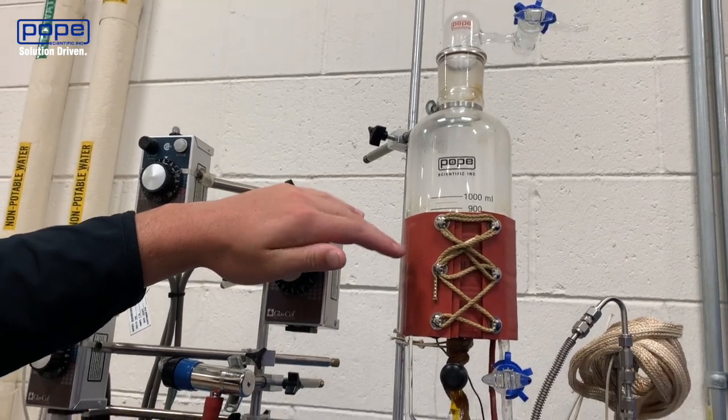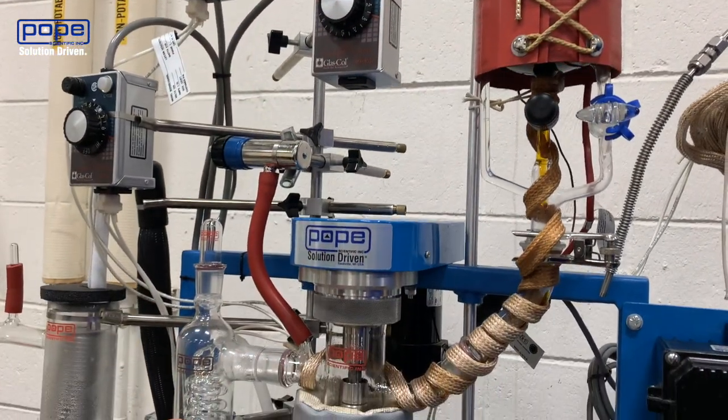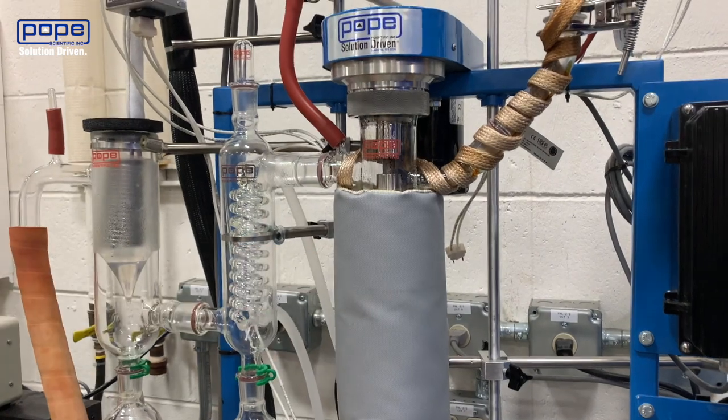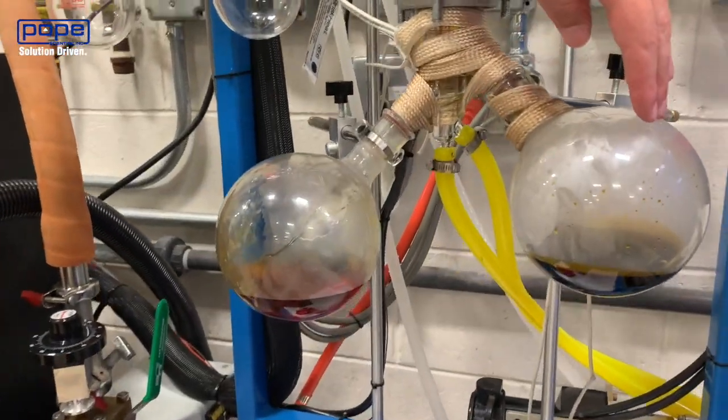As you can see, I have the material loaded in the feed flask and it's feeding down into the main column. This is where you're going to be separating your CBD from the rest of your residue material — the waste.